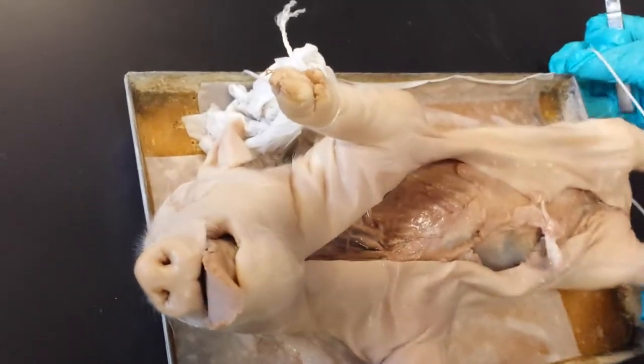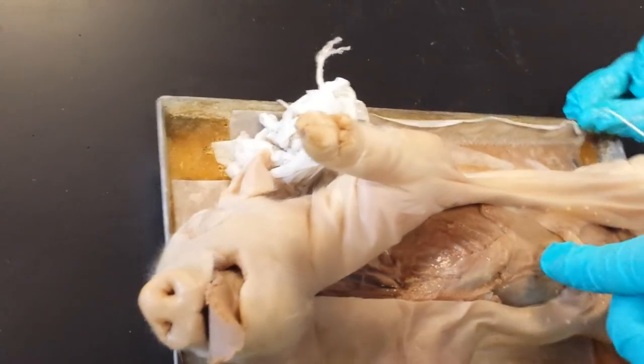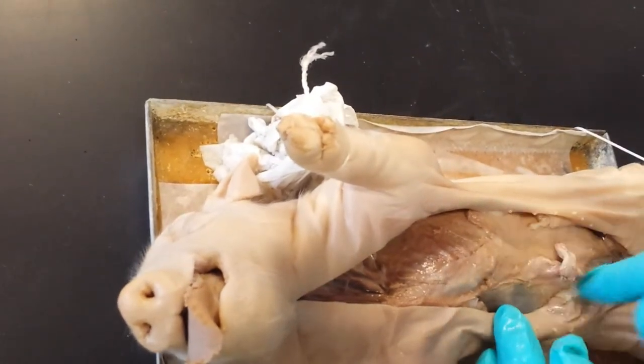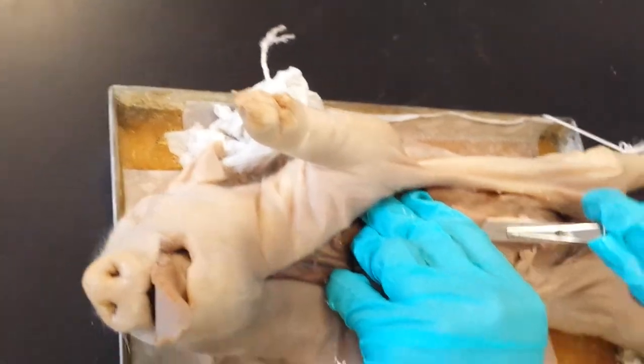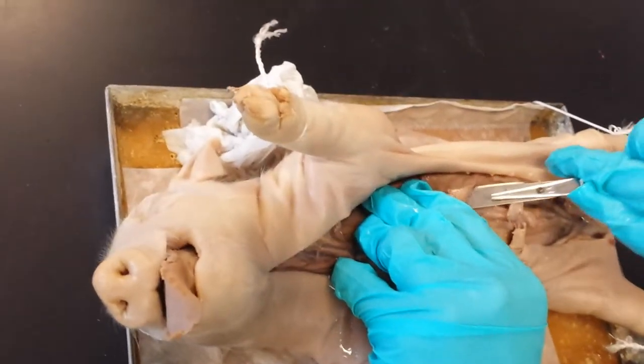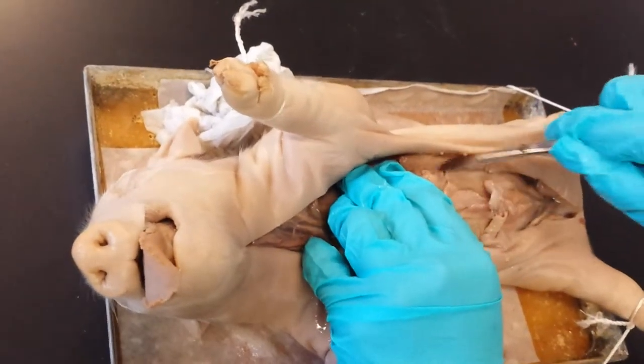Yeah, no, we didn't have that at first. What? I left. Well, improvise. There you go. Yeah, you guys gotta cut this little membrane right here. Start with the bottom first. What do you mean? So, like, cut around the umbilical cord. Okay. So you just cut the first layer. Wait, do you have the diagram? This part. Got it, yeah, now. There you go. After like 20 minutes.